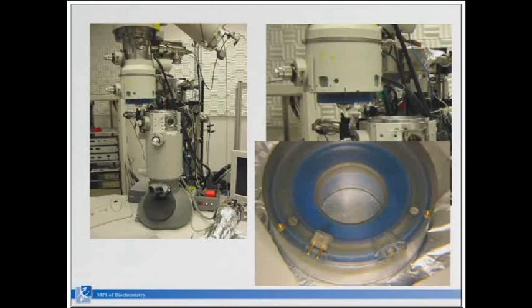So you put in only normal voltages here, and you get milliamps for creating the magnetic field inside here. And when this casing, where the cooling liquid is flowing, cracks, you will have water directly in contact with electricity, which is not very good. But that's normal. That happens sometimes. And so you see here a plastic casing, but thank God, plastic casings are no longer in fashion. So you're using metal casings, which normally can't crack like this.